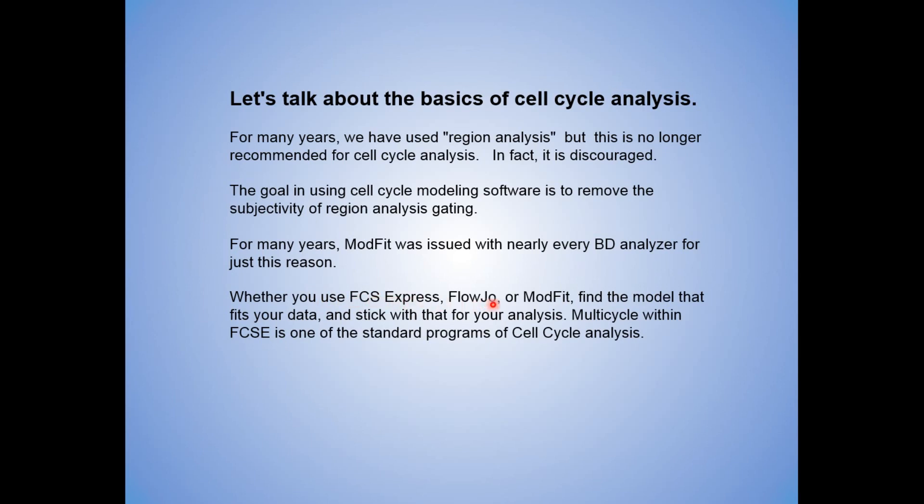But whether you use FCS Express, FlowJo, or ModFit, grab onto any of those. Stick with them for your analysis. Multicycle comes with FCS Express and it's the one I'm going to be working with here.